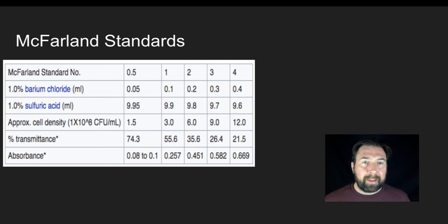That gives me something to tell me about the impact of certain types of fertilizer on population growth. Moreover, I can compare with both my negative controls and positive controls to see how that impact is relative to other conditions. I hope this is a useful standard for you in order to figure out the rate of algae growth in your different conditions.